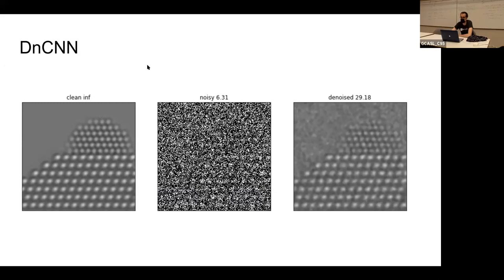This measure here is basically the signal to noise ratio. Here we have ground truth because we know the simulated images. We will show you the results on the real data a bit later, but this is just sanity checking the method on clean images. Since we know the ground truth, we can compute the ratio between them, and that's our measure for how well we're doing. As we will see in a moment, we were not satisfied with this, but it is pretty crazy that you can estimate this from just this.